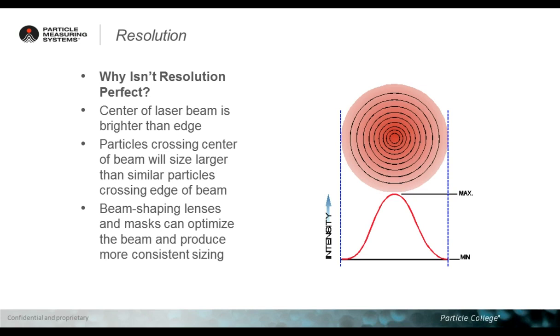Why may the resolution not be perfect? This is mostly related to the laser beam characteristics and performance. Just have a look at this red circle.